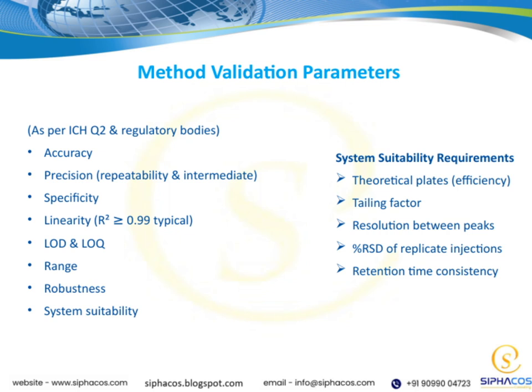Next, we look at the % RSD of replicate injections. This statistic helps us understand the precision or reproducibility of our method. Lower RSD values mean more consistent results. Retention time consistency is another key point. Stable retention times ensure that our method is reliable over multiple runs.